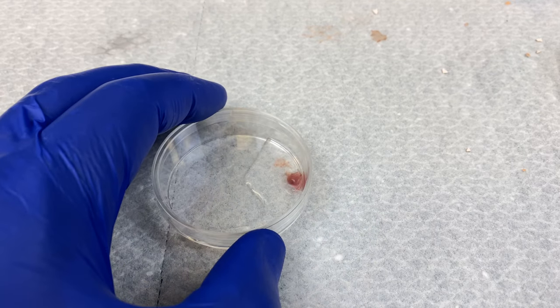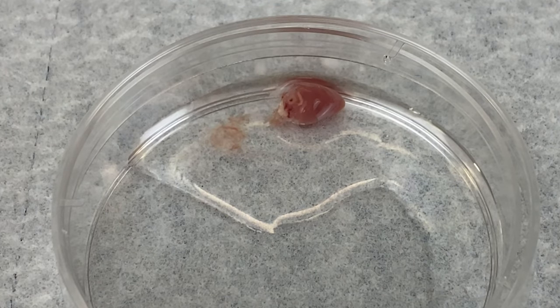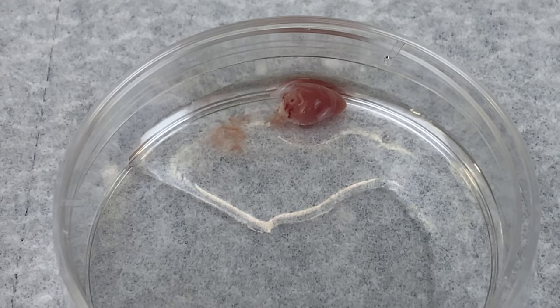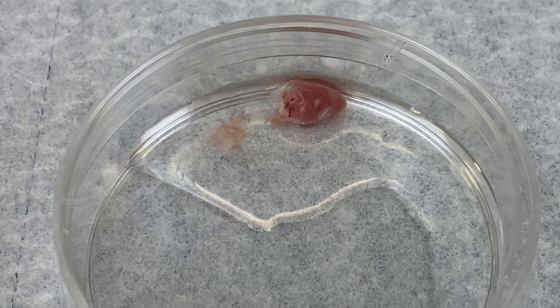Here is the heart. Now watch carefully. Did you see that? Because the sinoatrial node is found in the heart — that's the pacemaker — the heart can beat on its own outside the body. And that's what you just saw. Keep an eye on this when you're doing your dissection.